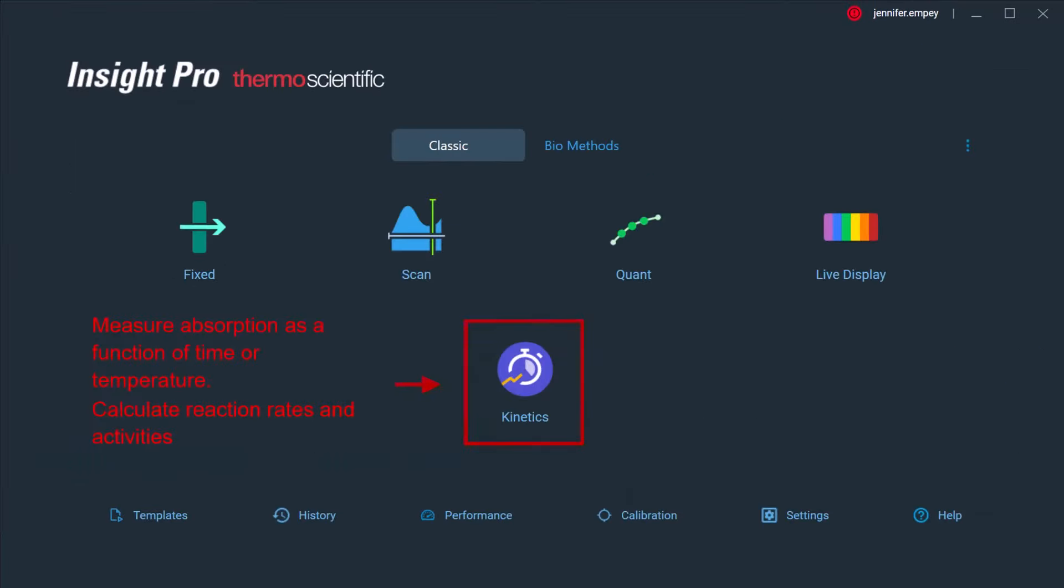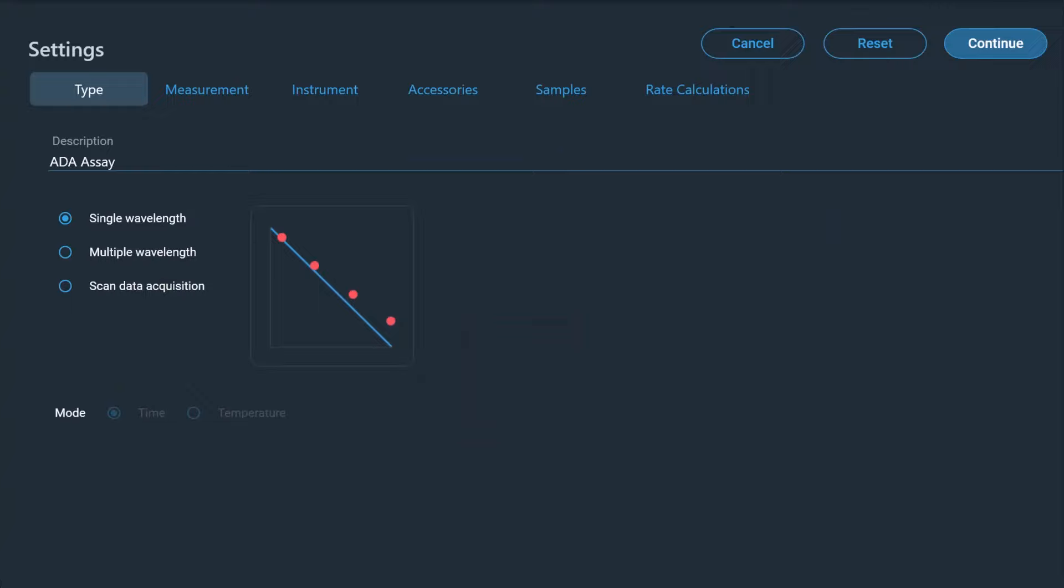The kinetics application can be used to measure the absorbance of a sample as a function of time or temperature, and is commonly used to determine rates of reactions. The sample can be monitored at a single wavelength, at multiple wavelengths, or a spectrum can be collected at each time point.